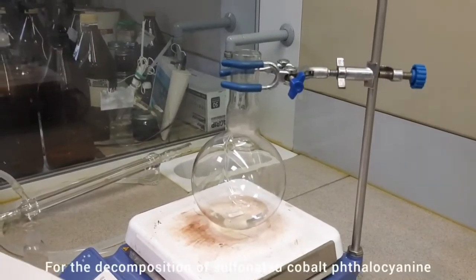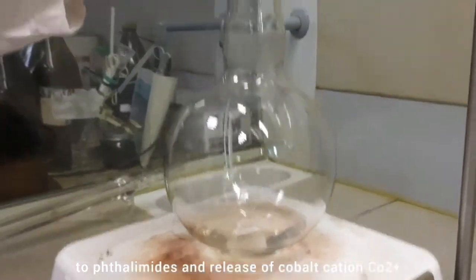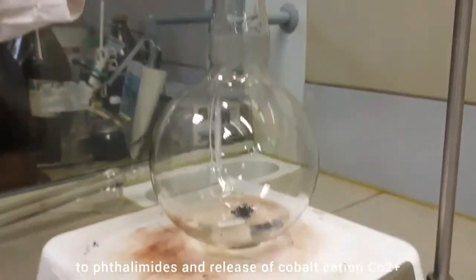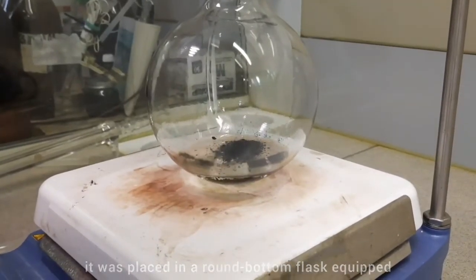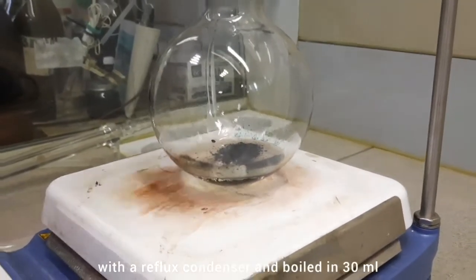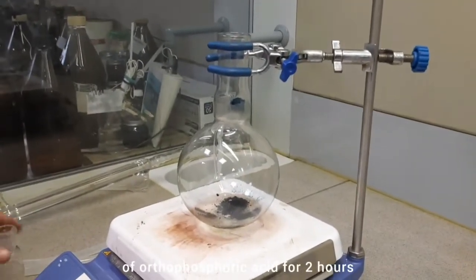For the decomposition of sulfonated cobalt phthalocyanine phthalimides and release of cobalt cation Co2+, it was placed in a round bottom flask equipped with a reflux condenser and boiled in 30 ml of orthophosphoric acid for 2 hours.